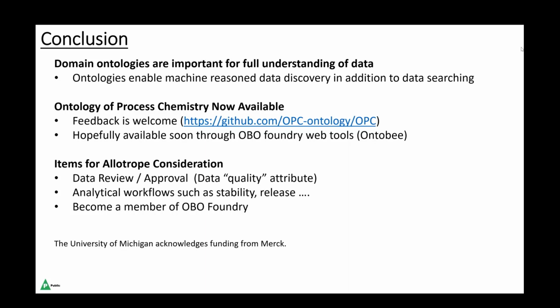There are two questions. How are the ontologies populated, and which reasoner has been used for reasoning? We use the HermiT reasoner. For the term population, as Wes mentioned, we use the so-called XOD, extensible ontology development procedure. Basically, it's top-down and bottom-up.